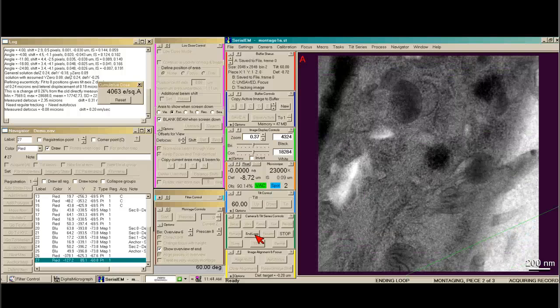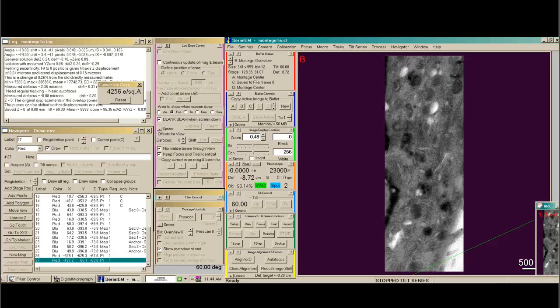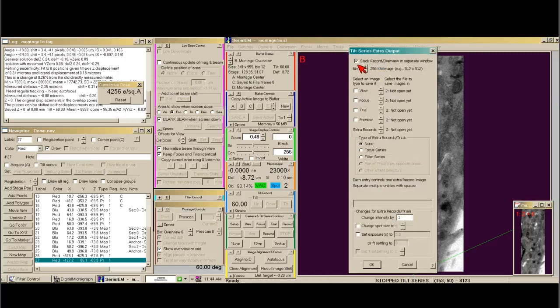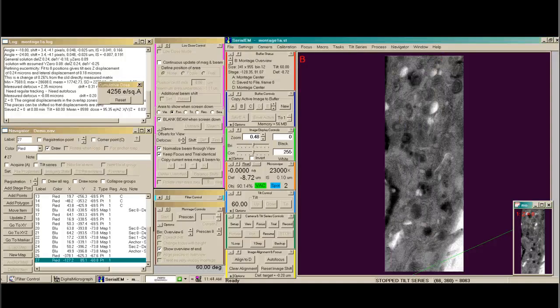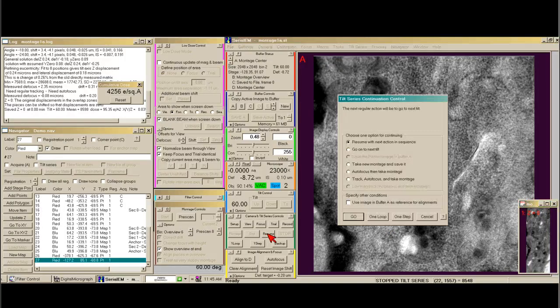There's the first panel. If you look at the buffer status, you'll see it's piece one in X and piece two in Y, and now it just did three. At the end you'll get our extra output box — which under Tilt Series, Extra Output, you can tick this box — that allows you to get a little stack you can look through. You'll see in the B buffer the entire montage image, and in the A buffer the center image that's used for aligning during tilt series acquisition. I'm happy with what we have, so I'm going to say resume and continue to the next tilt.